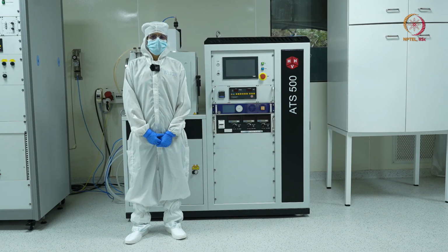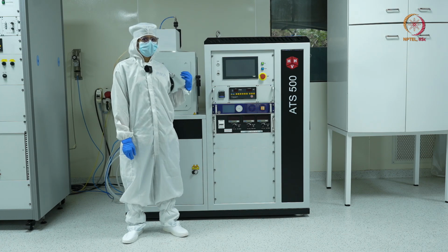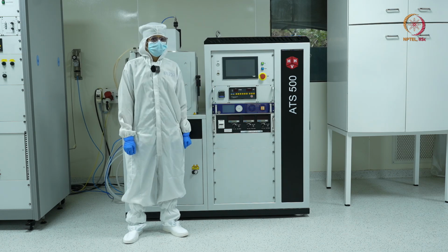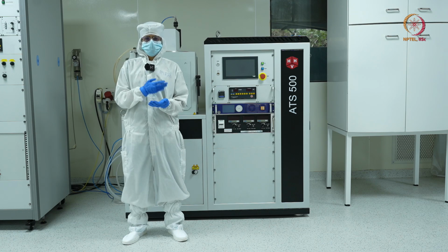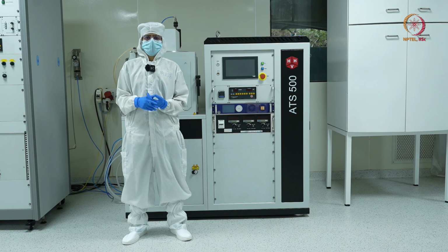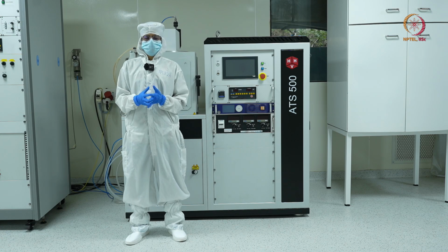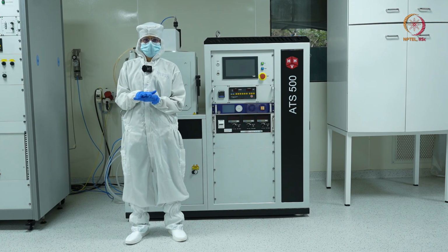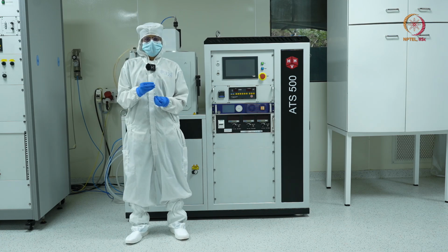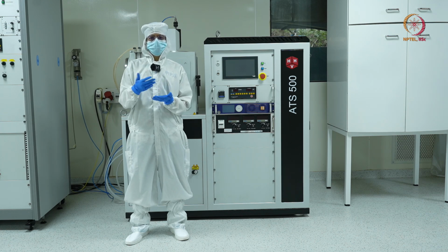Welcome to the lab demo. Today we'll focus on sputtering and we'll see how this tool works and how we can deposit our desired material using sputtering. As the professor might have told you, three major fabrication steps are additive, subtractive and patterning. In the additive step, we are adding some material onto our substrate or a wafer. That material can be a metal, an oxide, or an active layer. Depending upon which material we'll be depositing, we'll go with the tool required.